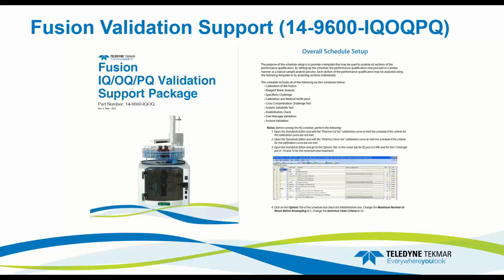Also within this IQ/OQ/PQ, we're testing the calibration features and the reagent blank analysis. We're doing specificity challenges. We're looking at calibration and method validation. We're looking at cross-contamination challenges, the famous system suitability with sucrose and 1,4-benzoquinone, and your reagent water, and other types of items that need to be done for the pharmaceutical environment.